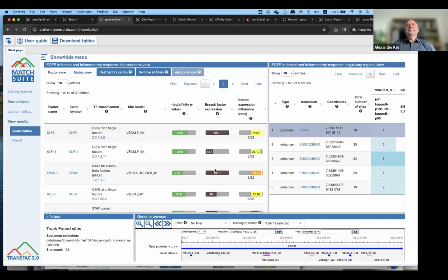The PDF versions you can surely open. If you have TRANSFAC, as you saw, it takes only a minute to regenerate it in the system, the launch is very quick. Otherwise, we will send you the analysis reports as PDF documents, and you can make use of them for your further studies. Okay, perfect. So please make sure that you send us your email addresses in the private mode.